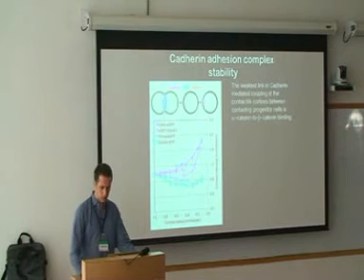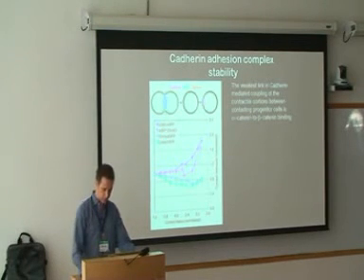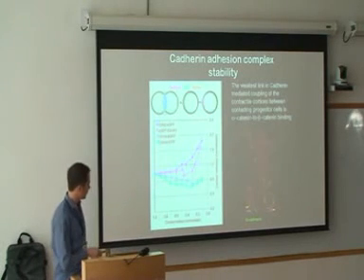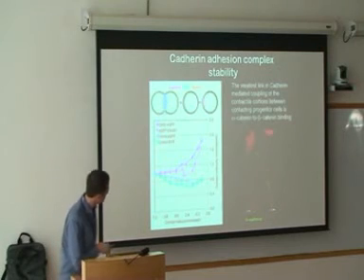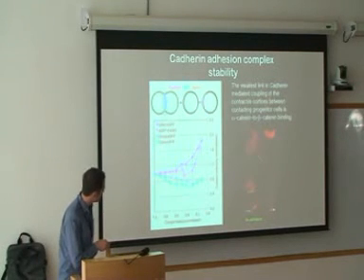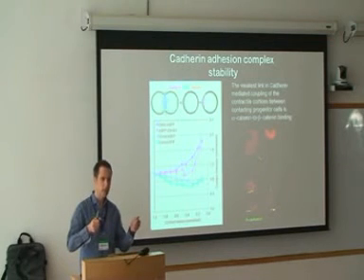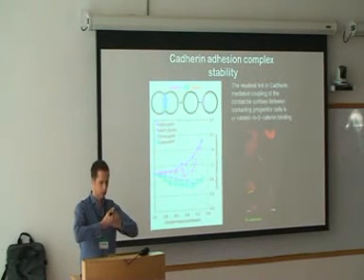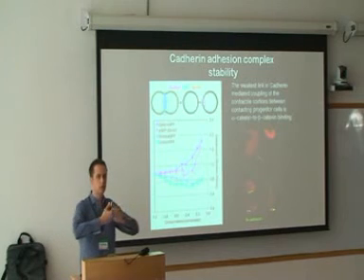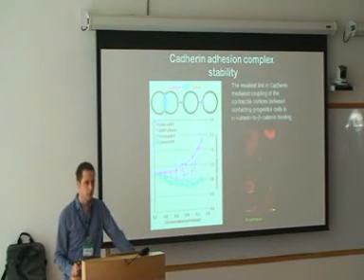Okay, so we know the weakest link is somewhere from the cytoplasmic tail of cadherins into the cytoskeleton. We wanted to know if that is something we actually see in the embryo again. We're looking here right in the embryo at mesoderm cells which are moving apart from each other, and again, it's very difficult to see for you. But you have to believe me, there are plasma membrane tethers, in cells which contain cadherins, indicating that when cells are moving apart, separating within the embryo, and they're expressing a GFP cadherin, cadherins do not dissociate at the contact, but they flow into plasma membrane tethers, and somewhere it breaks between the cytoplasmic tails of the cadherins and the cortical cytoskeleton.